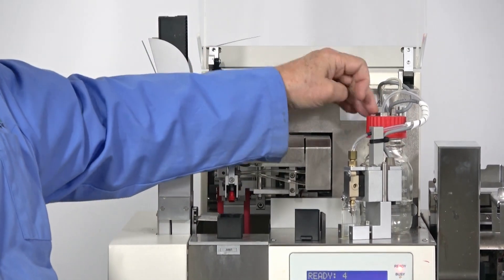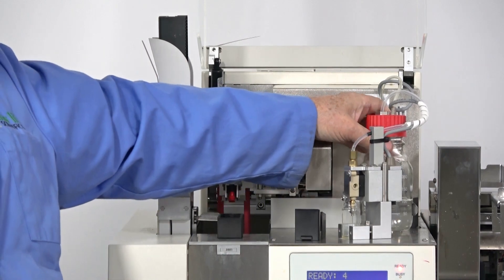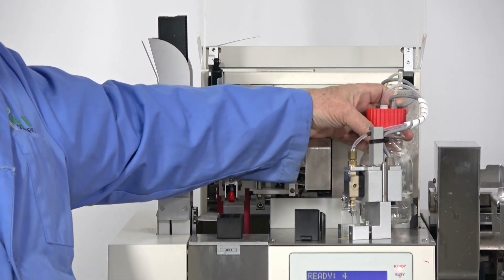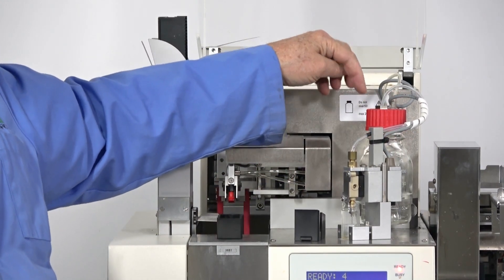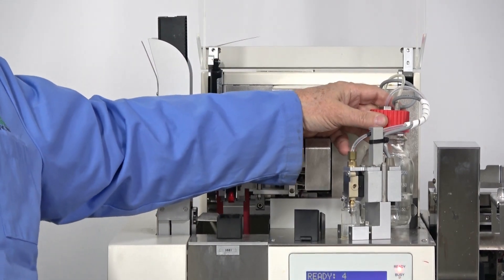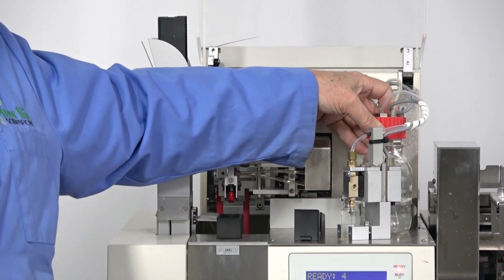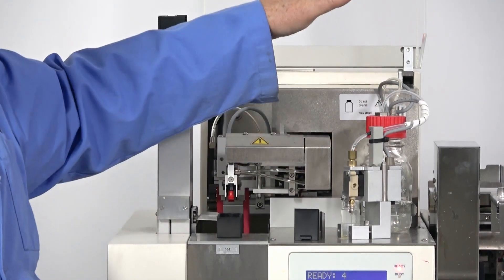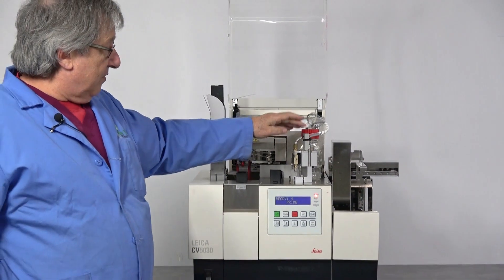A lot of times they won't have this container, the glass part of it, and theoretically I could live without the cap. It's just a lot of work. You don't want me to work, do you? Good. So, things to look for - that's one.